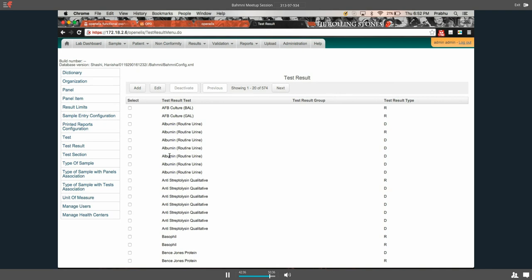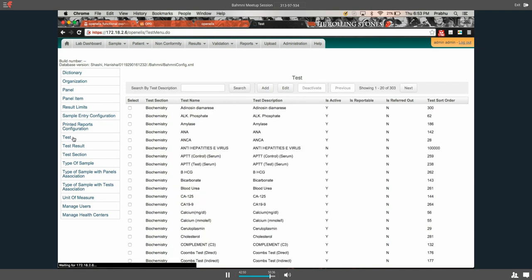Yes, the greater than is the most common one we have, where the equipment can only measure in a certain range. If it's outside that range and it's a cheap test, they would dilute the sample and redo it and scale it according to the dilution. But if it's an expensive test, it's not practical to do that.